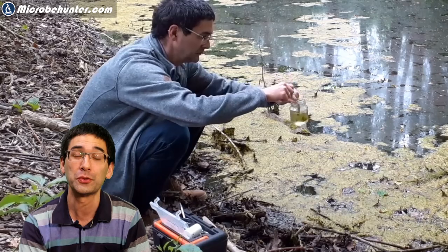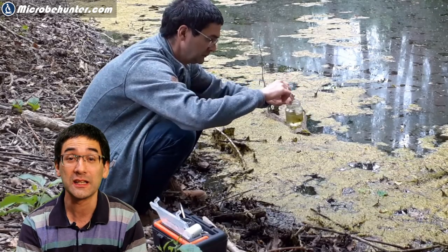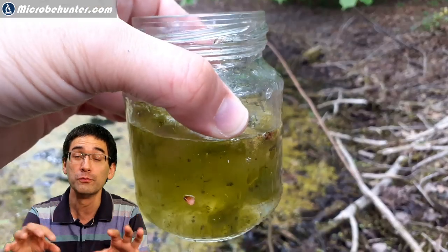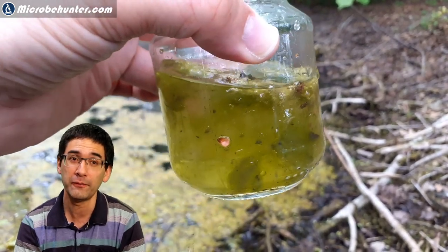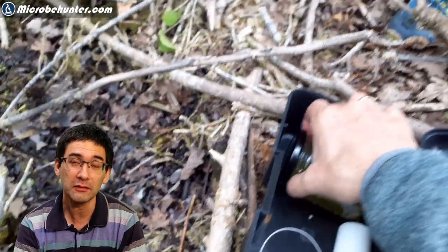Of course, these algae also produce plenty of oxygen. As a matter of fact, you can even see the oxygen bubbles caught inside the algae themselves.